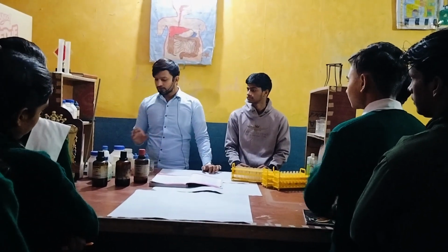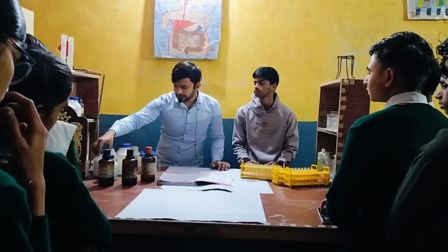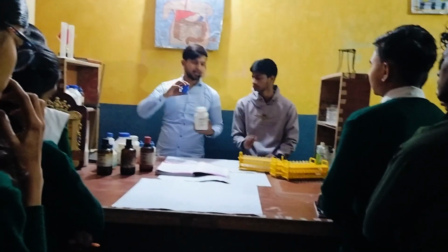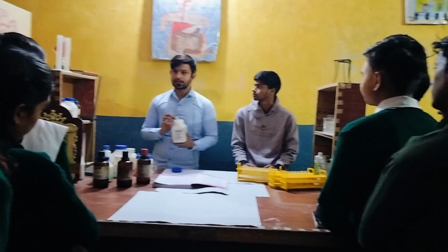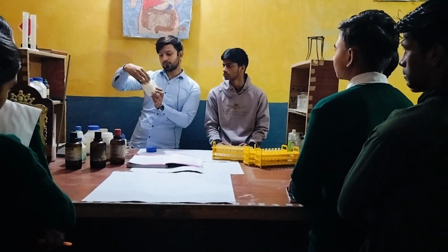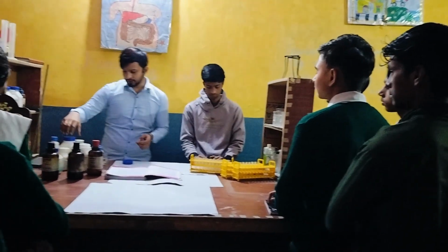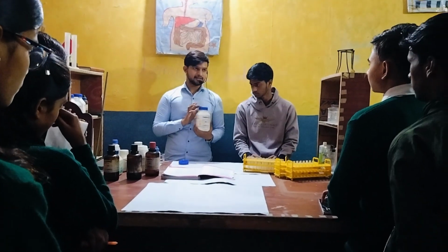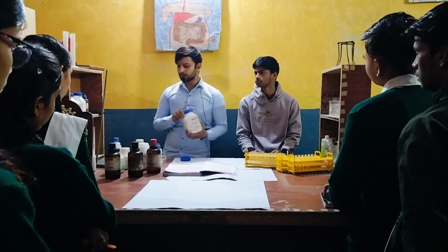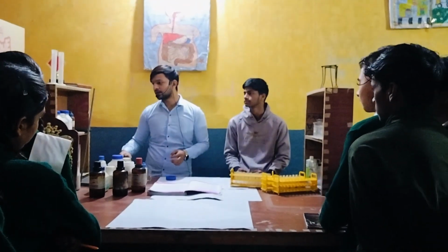We also have various types of salt in our lab. In this one we have ferrous sulfate, which is green in color. Next, sodium sulfate, that is Na2SO4. This is calcium oxide, CaO. This is sodium chloride, NaCl.